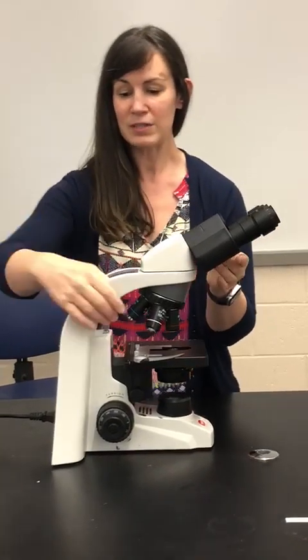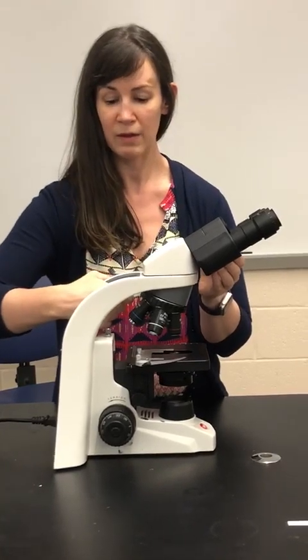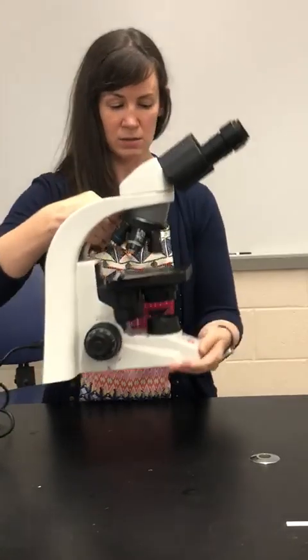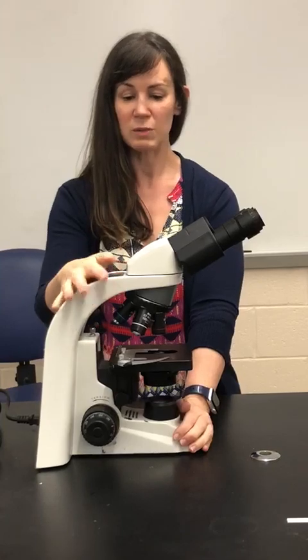As you work down, this is the arm of the microscope. Whenever you want to hold the microscope, you always want to hold it by the arm with one hand holding the arm and another hand underneath the base. Always use two hands when carrying around microscopes, especially these. We get the nice microscopes in this lab because we use them the most. So we want to be really careful and take really good care of them.